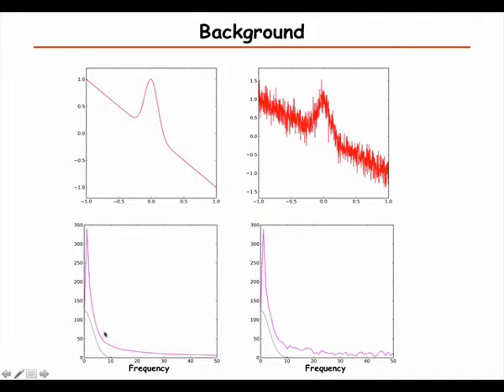And then the magenta is the frequency distribution of the combined Gaussian with the slope. So here what we see is that it's not easy to separate the two. There's a big overlap in frequencies, and when we add the noise, it pretty much looks the same, just with the noise background at high frequencies. So here we can't simply apply a filter in frequency space, not a simple filter at least.